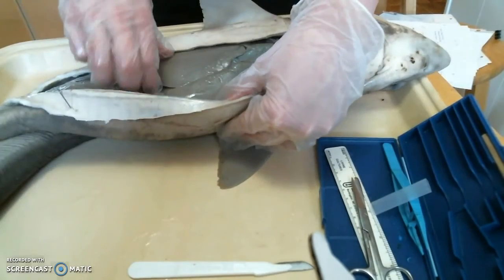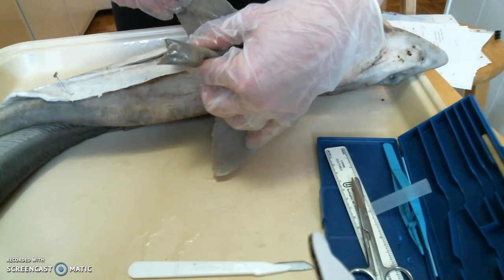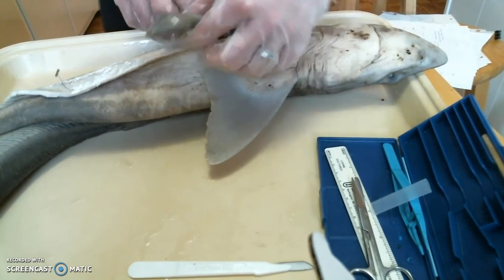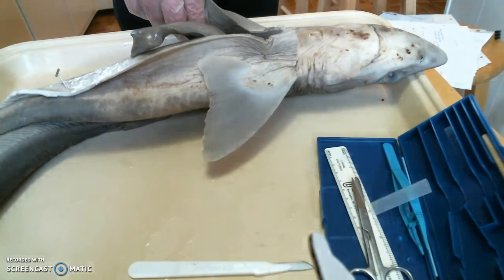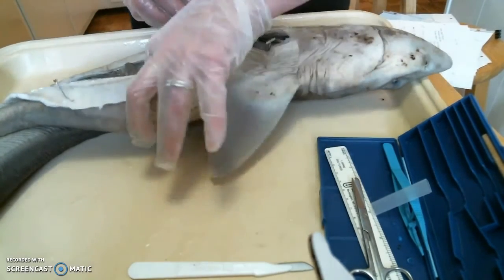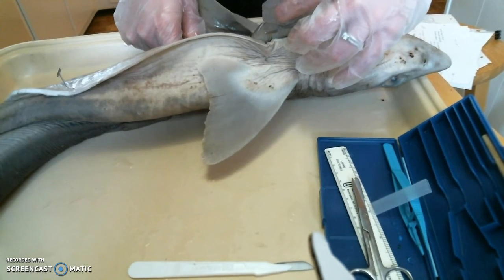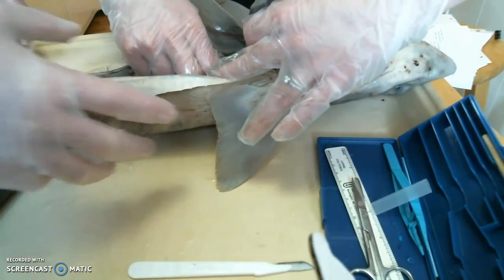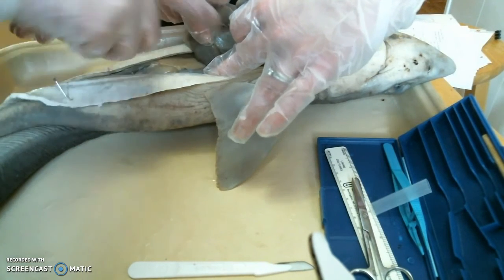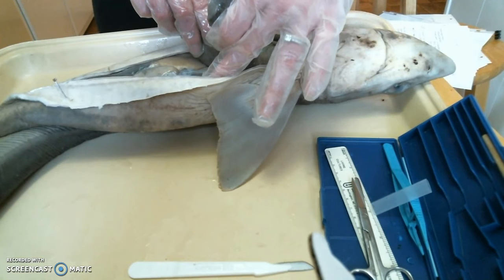Okay, so we've got one lobe of the liver here, and then we've got the other lobe of the liver, so you can see both of those. Then underneath is everything else, and that's what I'm curious about how I'm going to... Oh, this says 3 lobes. The green at the end of the center lobe is the gallbladder. So that must be the gallbladder, do you think, Char? That looks to be the center, and a little greenish, right? I'd say that might be the gallbladder. Yeah. Okay, so greenish center lobe is the gallbladder, this says.